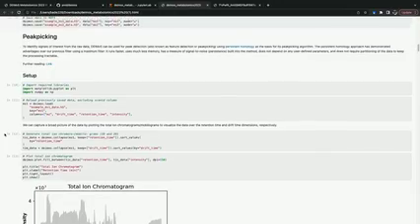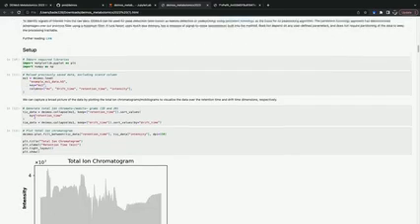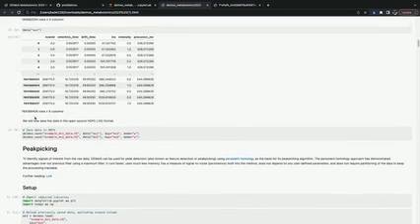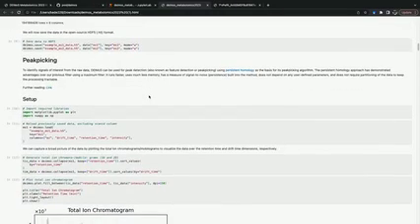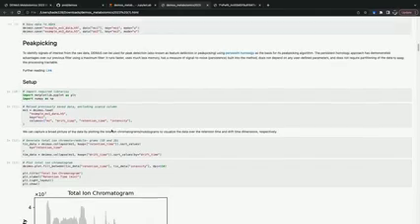You can see in the save section that you save your data under a specific key. So here we're loading the MS1 data, so the key is MS1, as you can see in the above cell. And so we just specify that here. I'm cutting down the columns so you can see from this raw data that there's scan ID, retention time, drift time, et cetera. I'm going to load specifically the m/z, drift time, retention time, and intensity.